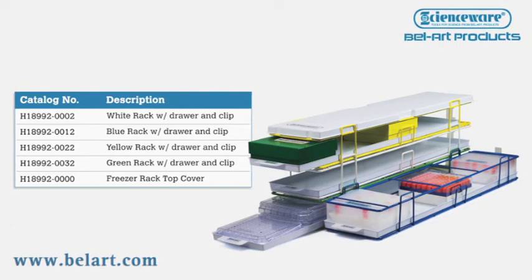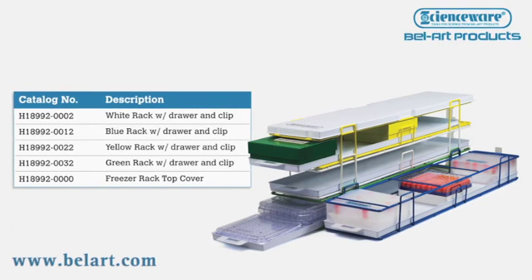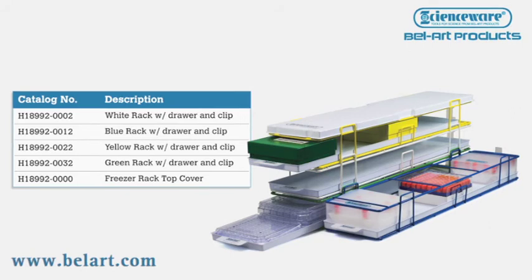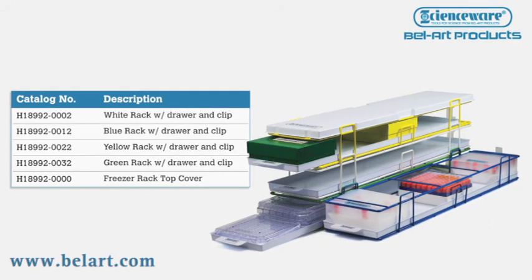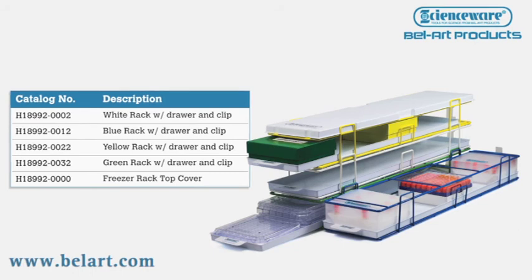ScienceWare modular, ultra-low, five-box freezer racks are perfect for customizing your freezer space. For more information, contact your local Bellart distributor or visit bellart.com.